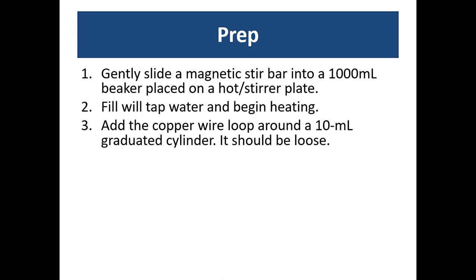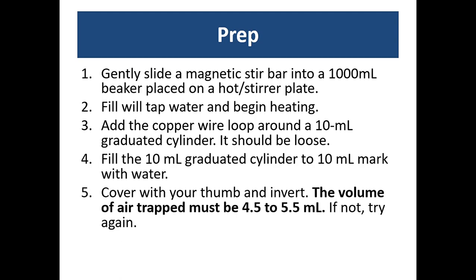Meanwhile, you're going to add a copper wire loop, kind of tie it loosely around a 10 milliliter graduate cylinder. It has to be loose because you have to be able to slide the graduate cylinder through that loop. You're going to fill the 10 milliliter graduate cylinder to about the 10 milliliter mark. Cover with your thumb and invert it so that you will have a trapped air bubble of about 4.5 to 5.5 milliliters. If you don't get that size of a bubble, try it again.